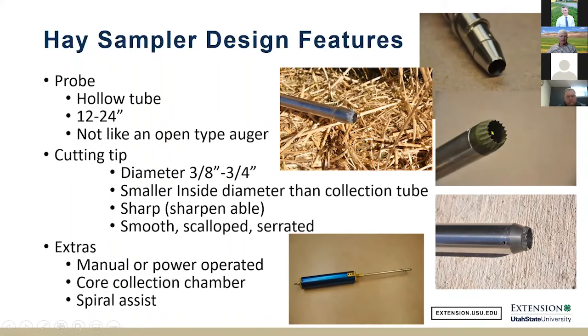And this one on the middle right is the newer Frontier Mills. They take very, very large samples, and inevitably when you take the 20 cores per sample, you'll have almost a gallon of material, and the sample will need to be pre-ground.